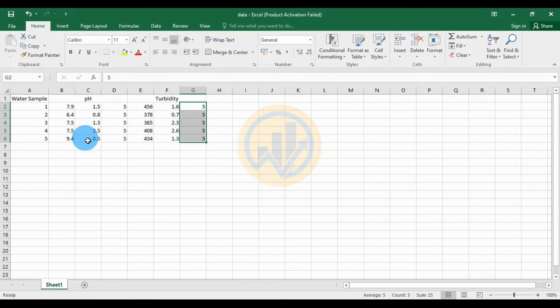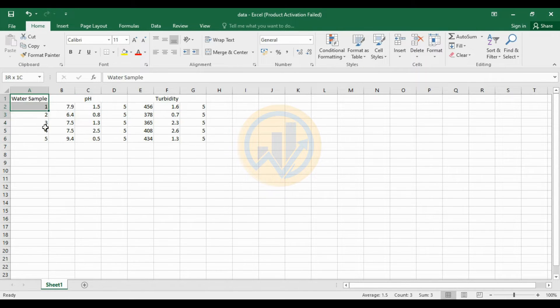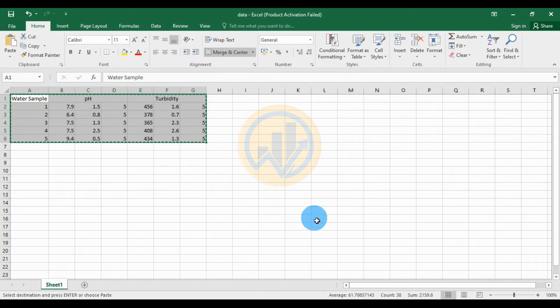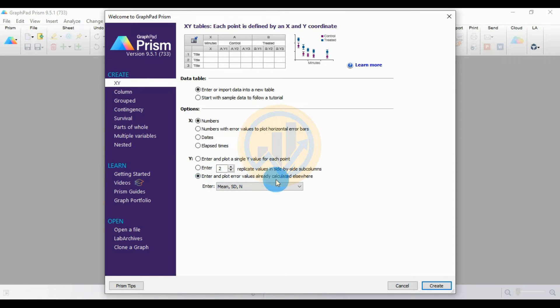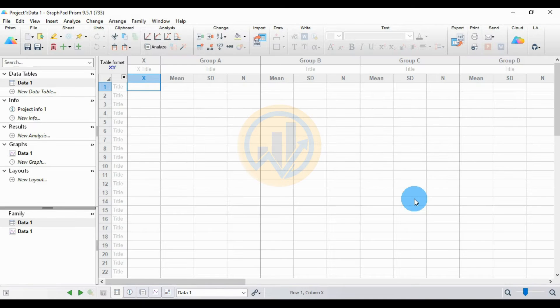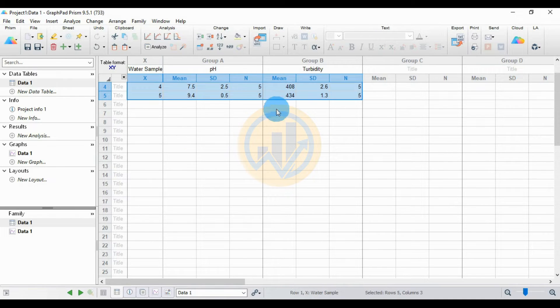The data has already been calculated in Excel software. Now copy and paste this data into GraphPad Prism software. Select the data and copy. Go to GraphPad Prism and create a new worksheet. Select 'Enter or import data into a new table.' Set the X-axis options to numbers, Y-axis selected for entry, and since the plot error values are already calculated in Excel, select the option for mean value and standard deviation. Then click the 'Create' button.